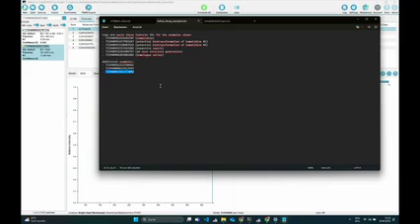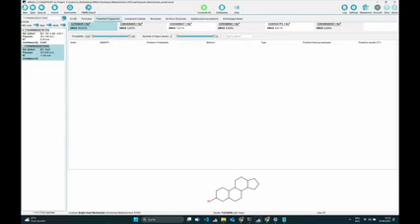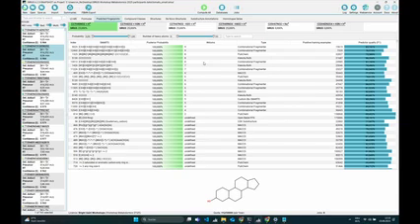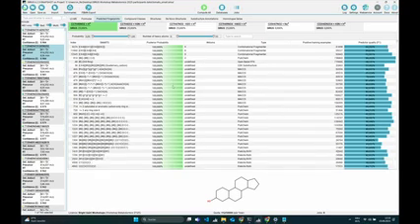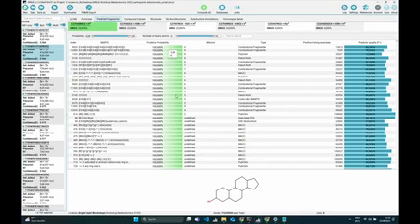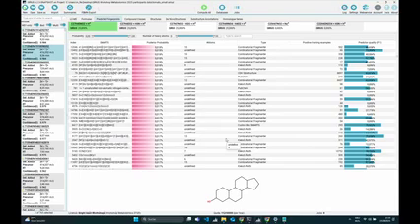Yeah, so maybe I can even show it in the software a bit. So let's check. What you can see here are all the molecular properties we are using, and they are derived as part of the training process.